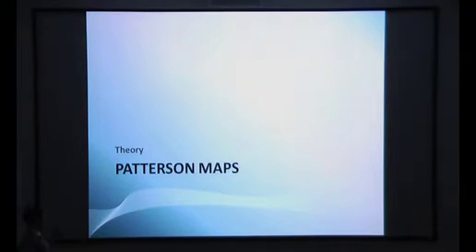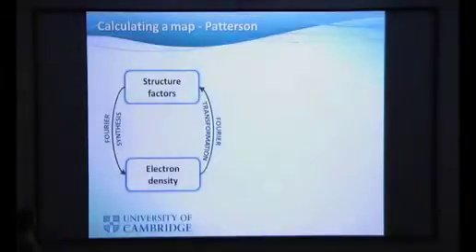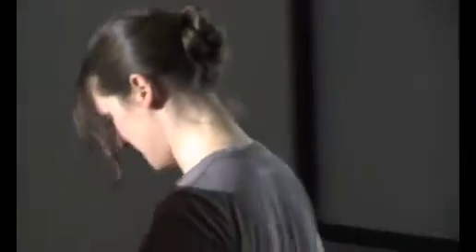Another theory topic: Patterson maps. I have to bring this up because a student in our lab told me that having a Patterson map is like pulling a rabbit out of a hat. And he does not know exactly where they come from, so I have to explain it.